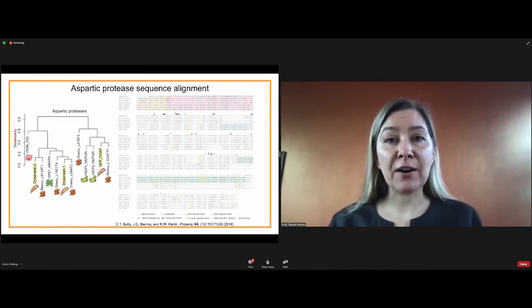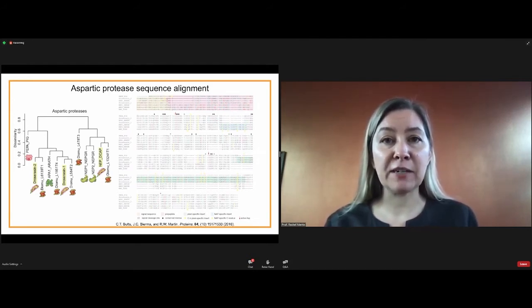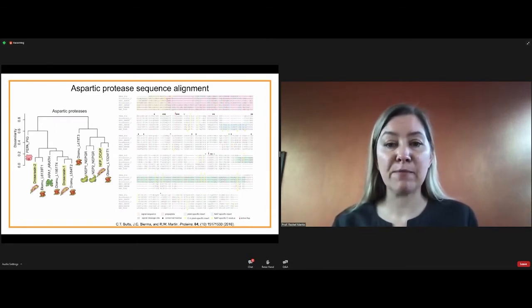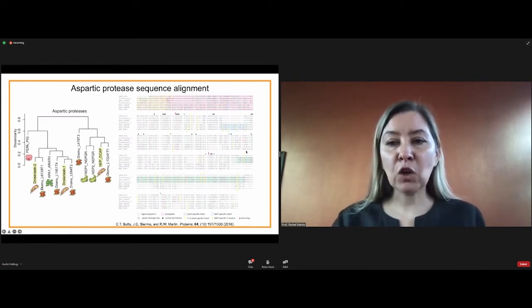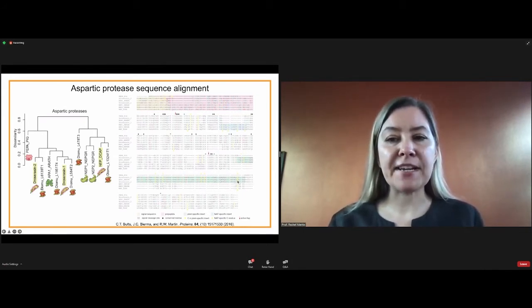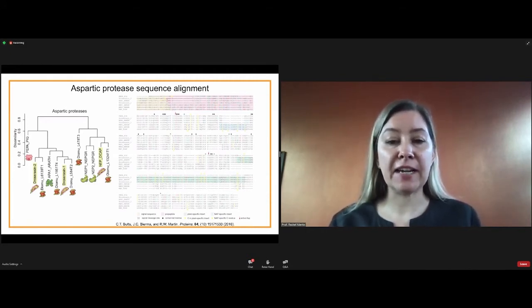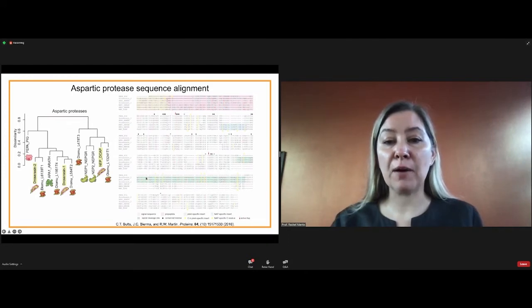And the reason that's there is that if you just made a protease inside the cell and let it run around unsupervised, it might cut up proteins in the cell that it's not supposed to. And so a lot of them are expressed with pro sequences that keep them covered up until it's time for the activity to start. And then we notice there's this region that's highlighted in green that is not in the pig protein, and it's only in some of our Drosera proteins. And that's a really interesting feature that it turns out that's what we took NMR spectra of. So I will get back to that in a little bit.